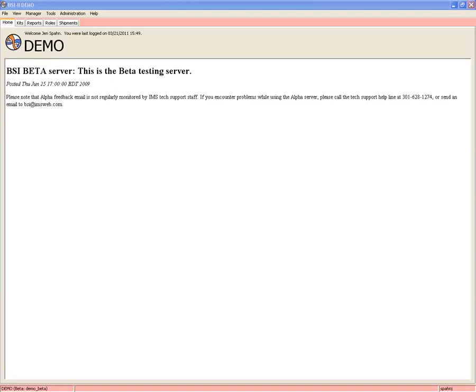Currently, the kit module is on the BSI demo database. If you are interested in it, it's a simple RFE, much like subjects, to add to any new database. After the webinar, if you'd like to send an email to BSI Feedback or me, we'll be happy to set you up with a user account on demo so you can try it out yourself.